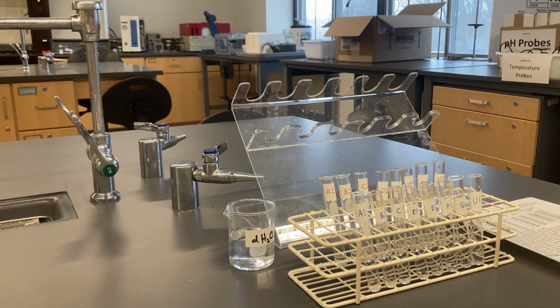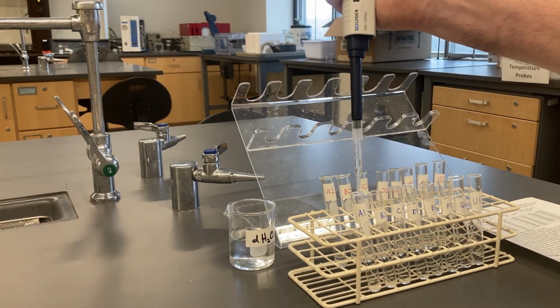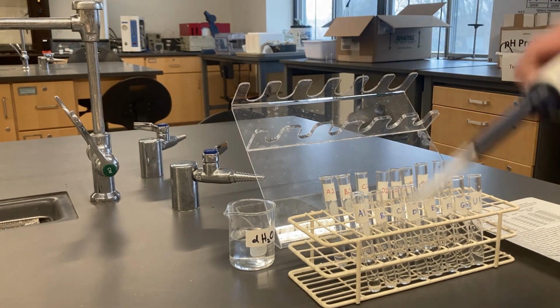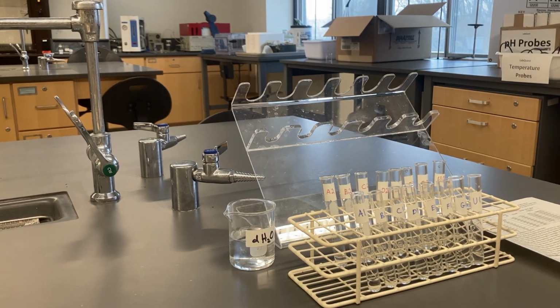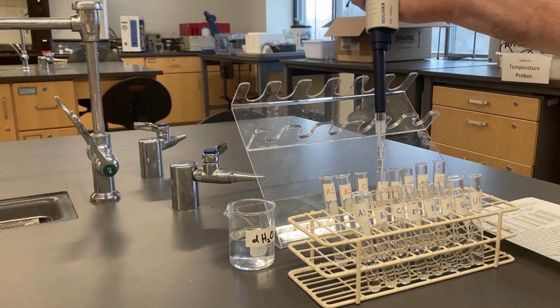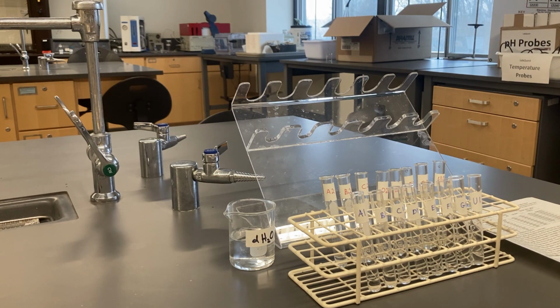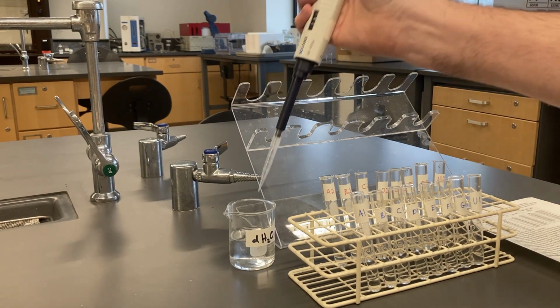I'm going to add 500 microliters of water to A1, and I'm going to add 600 microliters to B1, and I'm going to add 700 microliters to C1.